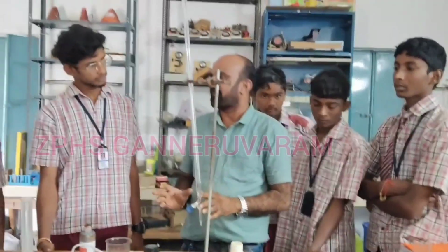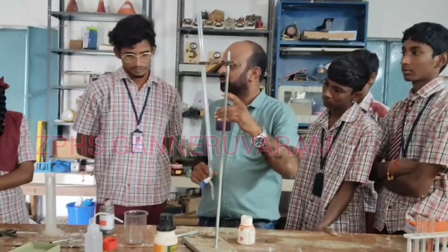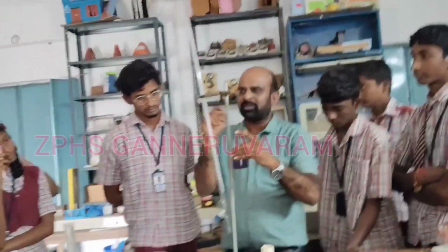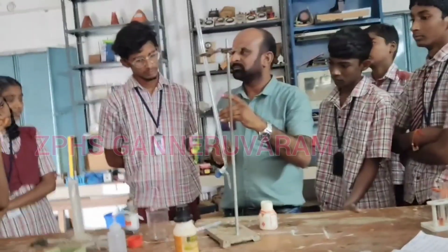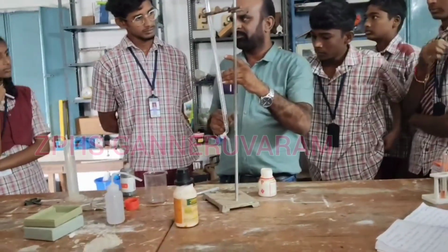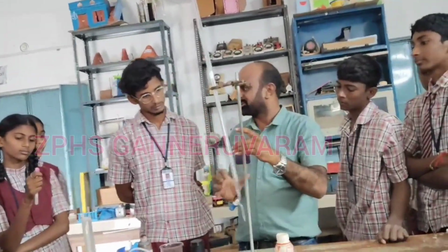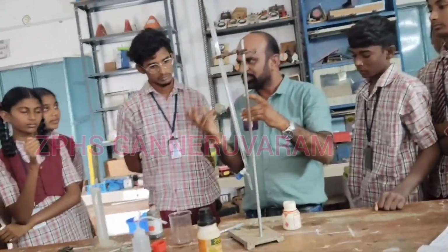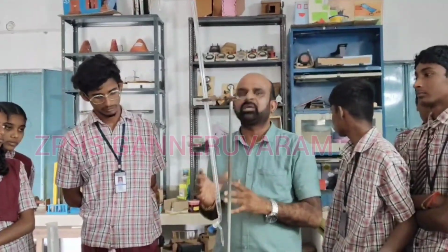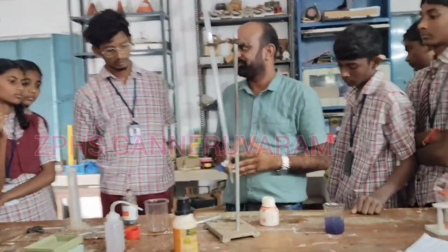Whenever you add HCl to the sodium hydroxide solution drop by drop using the burette, it changes to a colorless solution, because the HCl reacts with the sodium hydroxide. The phenolphthalein pink color disappears due to the neutralization reaction.